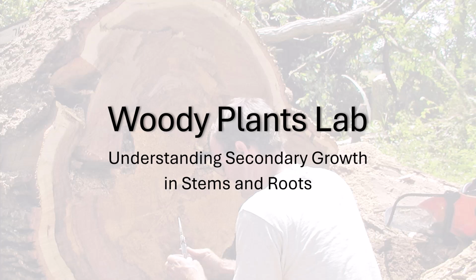In this lab, we're shifting from herbaceous plant structure to woody plants, the stems and roots that increase in thickness over time. Instead of preparing slides yourself, you'll be working with photos of microscope slides and labeled images, just like you did in the roots lab. The goal here is to learn how to recognize tissues, understand where they come from, and connect structure to function in woody stems and roots.